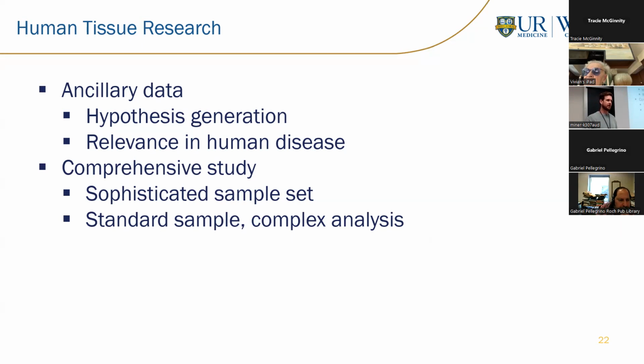I think it's generally good. I think it'll change, as I mentioned, we want more longitudinal collections. So if we can start a front door consent policy, like they have at Roswell, so any new patient, hey, if we end up taking your blood or doing a resection, can we use that tissue for research? I think in that setting, where everyone is a little more thoughtful of the whole situation, our accrual rate could be improved. But yeah, I'll have to get those numbers.